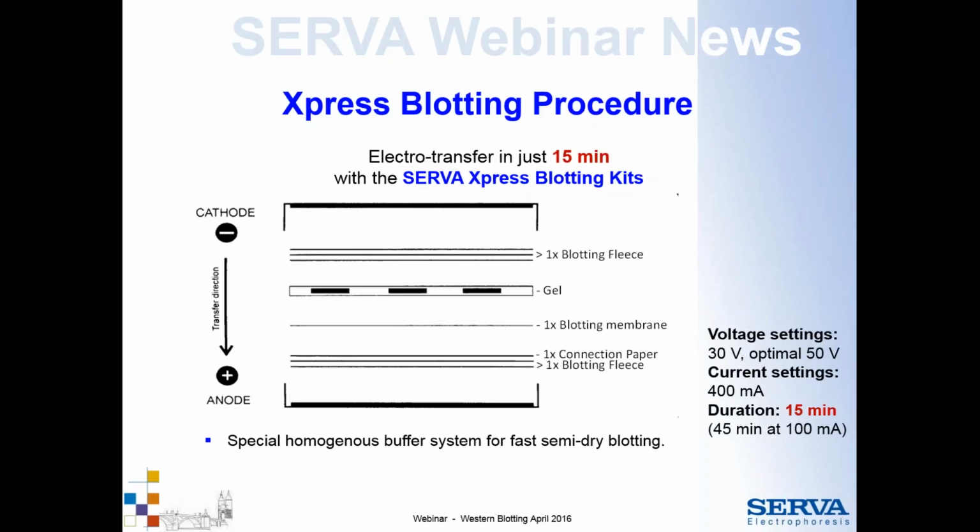With this buffer system and all these things included in the kit, you can also perform a slower blotting procedure by reducing the current settings to 100 milliamp. Then it will take 45 minutes.